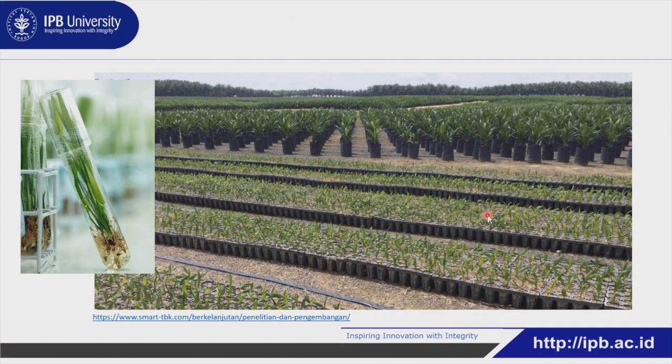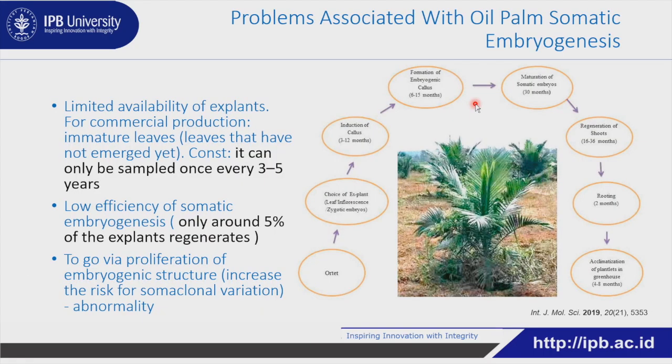After that, of course, they do the acclimatization in the nursery, and then they put it outside in the field for producing material for replanting. And it's not that easy. So here we identify the problems associated with oil palm somatic embryogenesis.